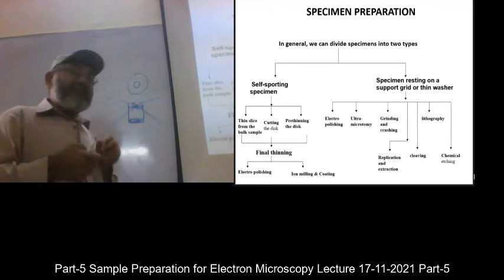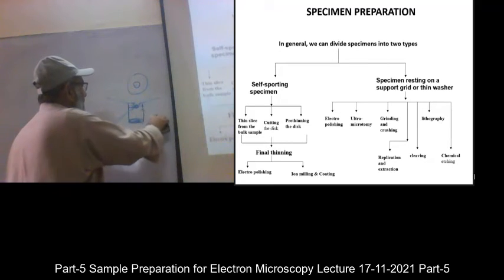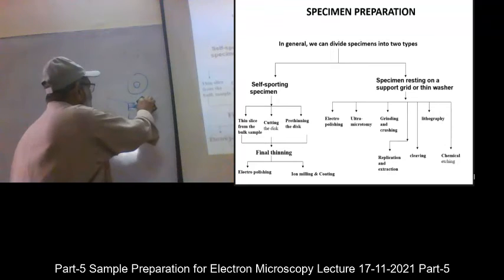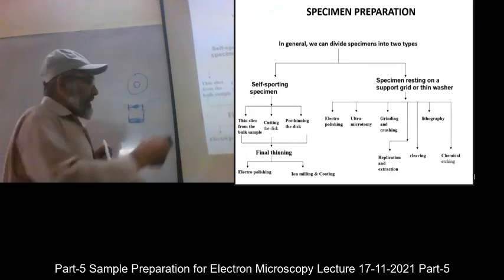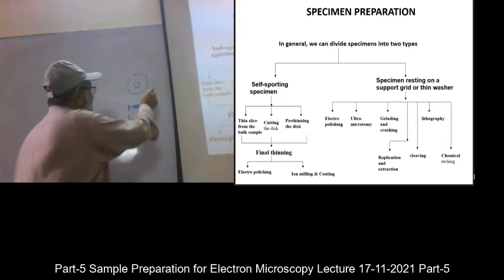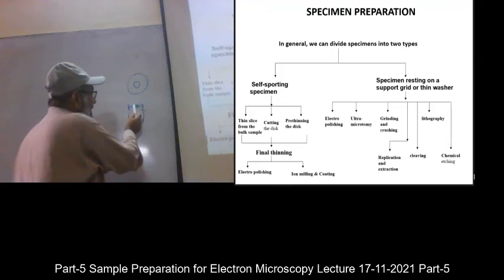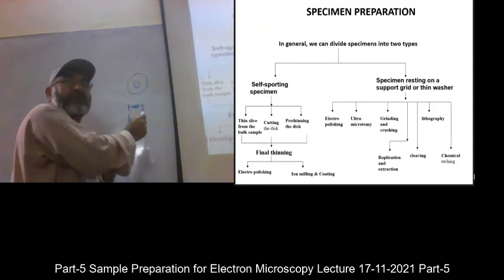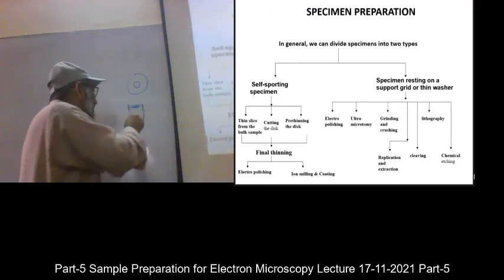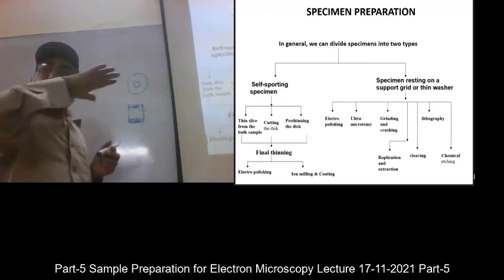that yes, now it is transmitting the light, then instead of this angle, you decrease the beam angle, like instead of this, you decrease it like this, so that it just skips the surface finely. It's not going deep into the sample. It's not hitting deep into the sample. Similarly here, and it just skips the surface.